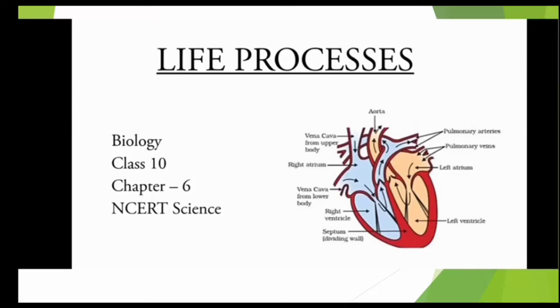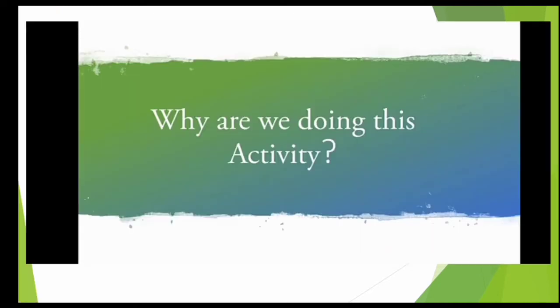Hello everyone, in this video I will tell you how we write the activity and how to do this activity in your lab. The very first thing, why are we doing this activity? We are doing this activity to check the presence of starch in green leaves.